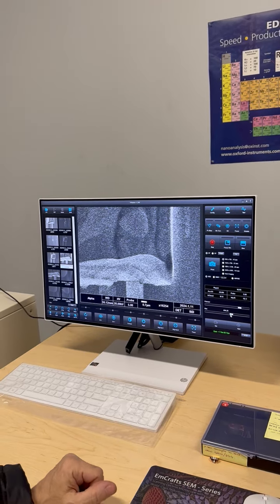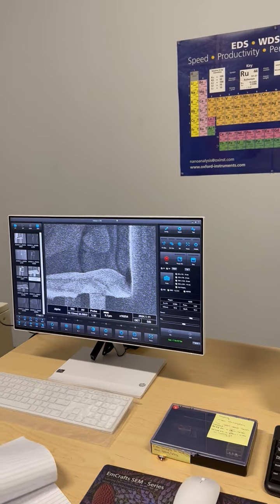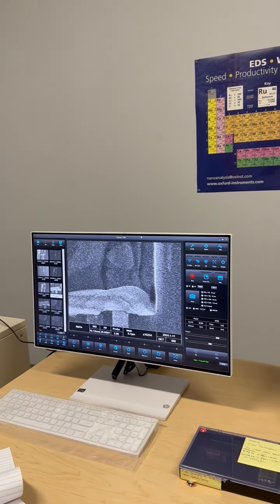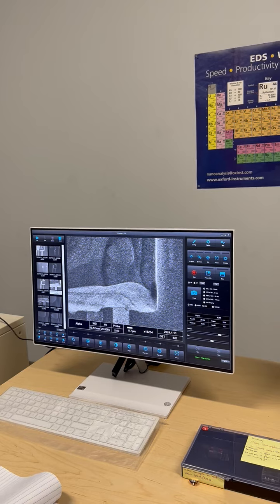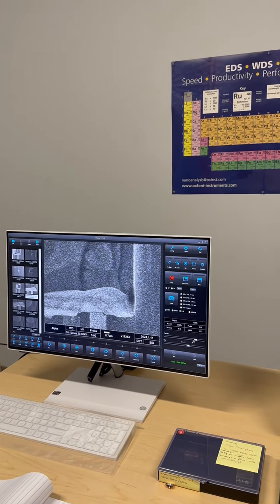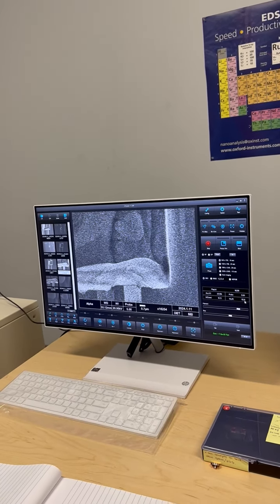Let me explain this quickly. We do not change that. But when we see the number go down — if the gun current goes down — you can adjust the bias to bring it back up to 120 or 112, or whatever I have it set to. So that's the filament.